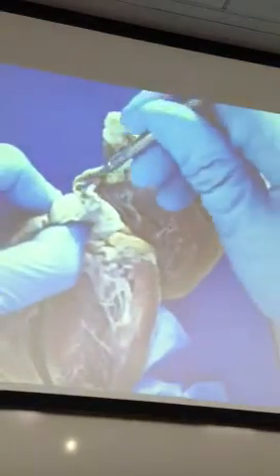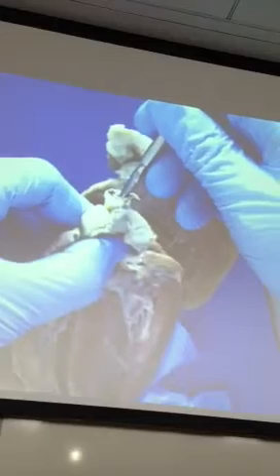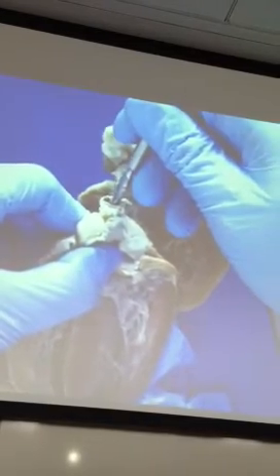That's what's represented up here. The other part of it has been chopped off, but you can still picture it. That's the aorta going up. The big part here where my finger goes is the arch of the aorta. This little branch coming off would represent the brachiocephalic artery, also known as the innominate artery.